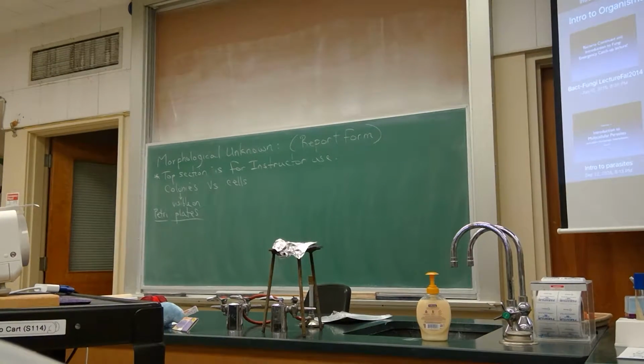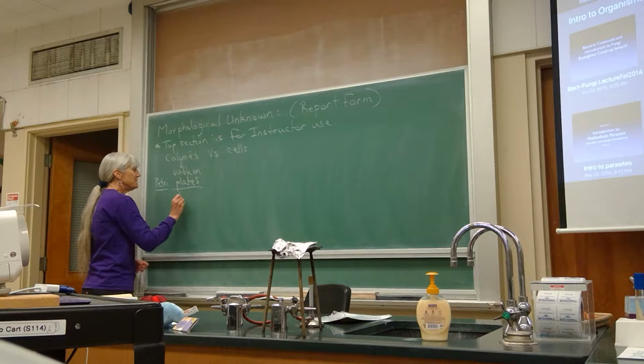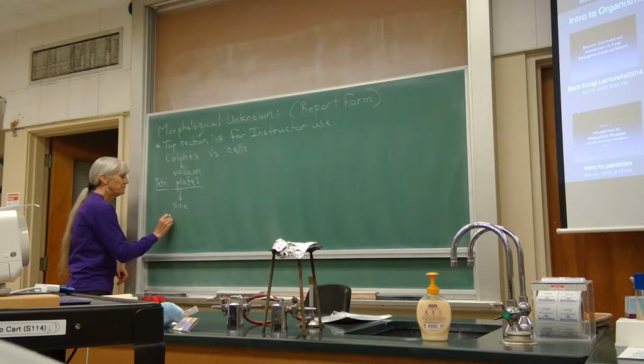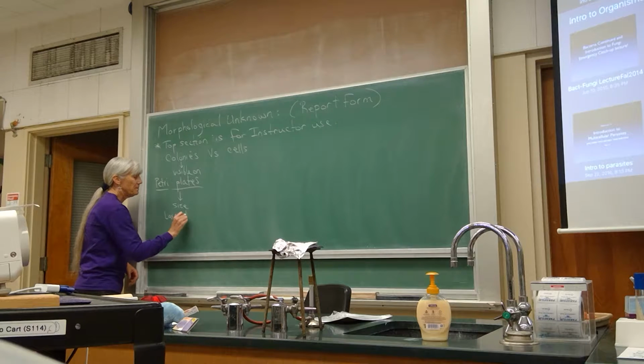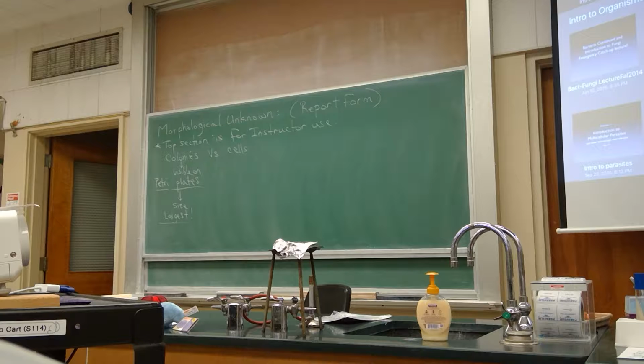Colony size is quite variable. So if you're measuring colony size, typically you look for the largest, and let that be your guide. Use that for your descriptions. You're looking at form, margin, elevation, surface texture, optical character, etc. We measure them. The size is in millimeters.